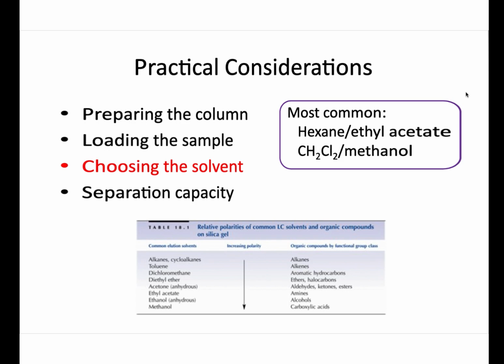This is the list of the solvents. Which solvent should you use? It's not a wild choice. You don't randomly pick a solvent that you have available in the laboratory and use it. You have to play with the less polar and increase the polarity, and so on, until you get a better separation with higher resolution.